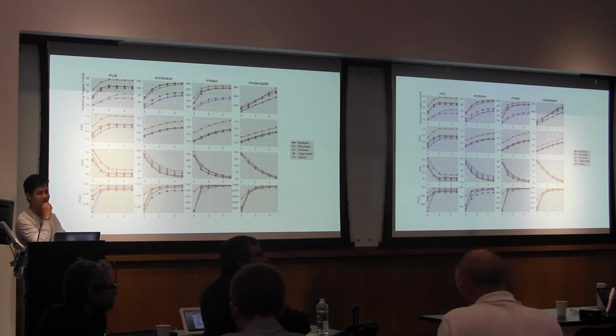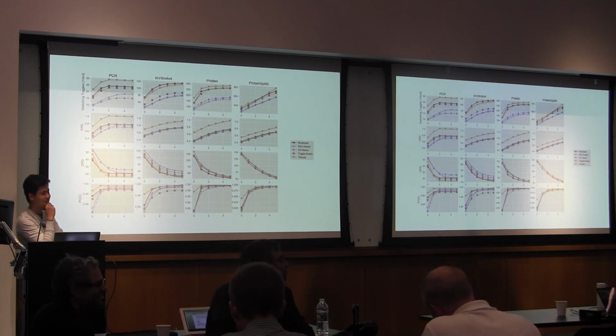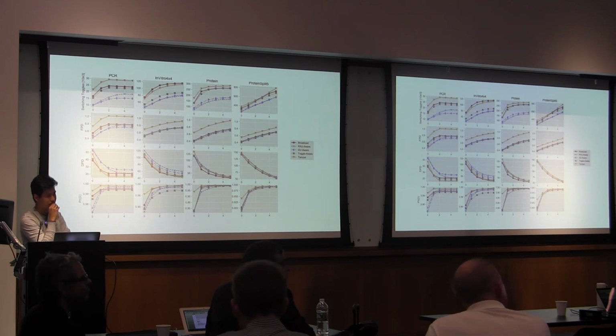Yeah, I have one question. So you divide it into PCR assay or protein assay, but it seems like to get to the core of it, it's really a question of the droplet operations that occur for each of those. Does one type of assay need more droplet operations than another?